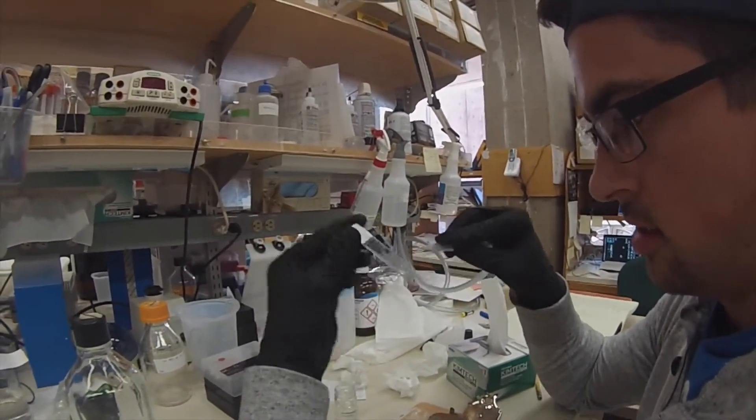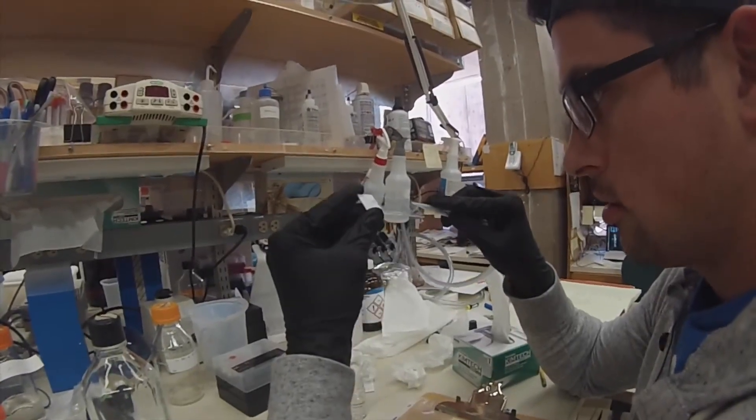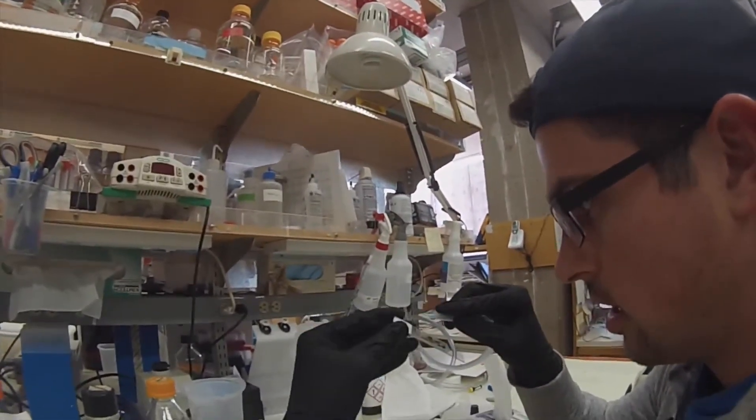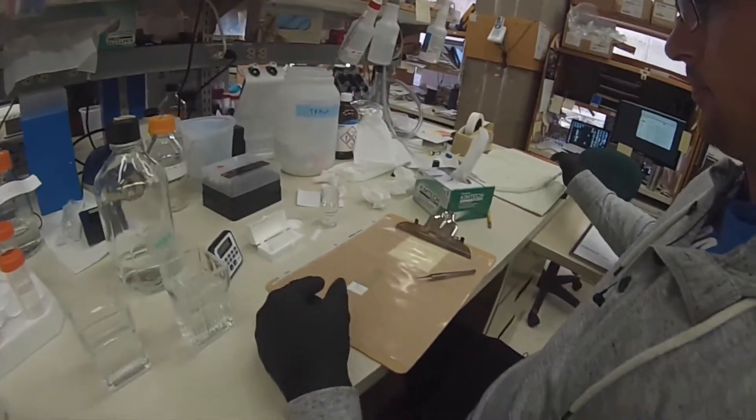I'm always really cautious about that, so I really go on the side of the pap pen, which is what you use to try and hold all the primary antibody, secondary antibody, and blocking buffer in.